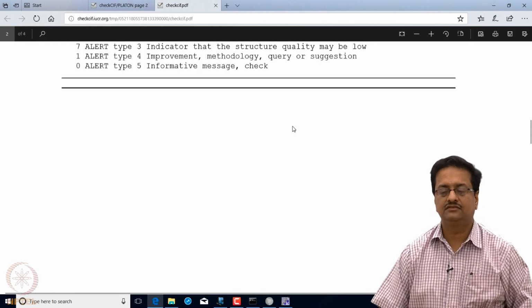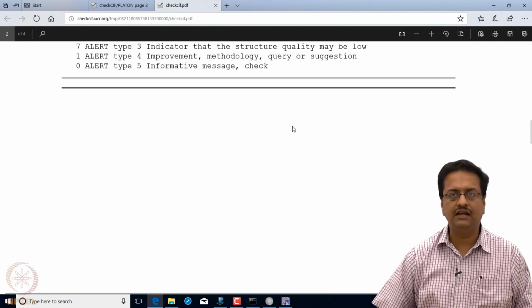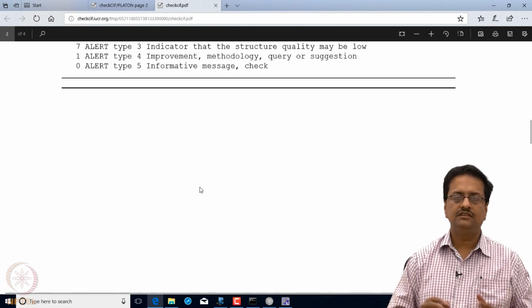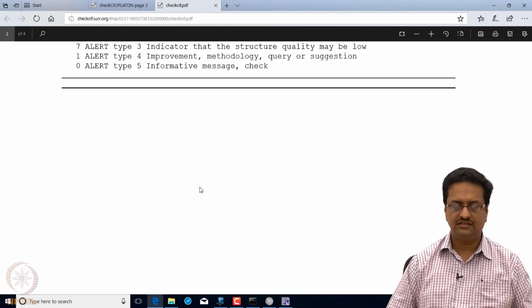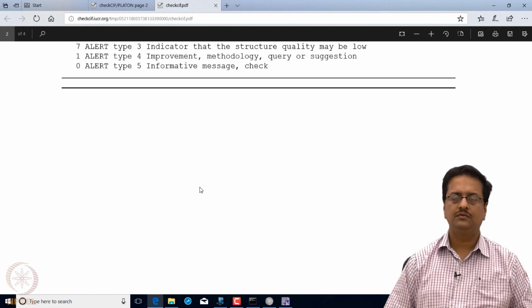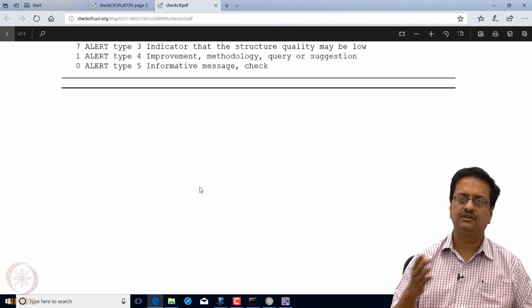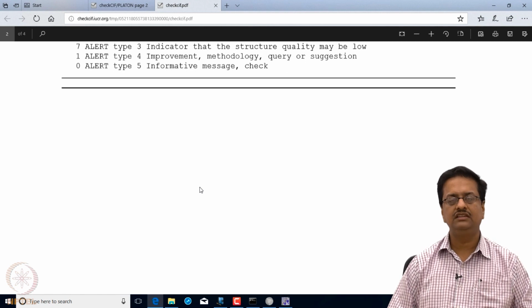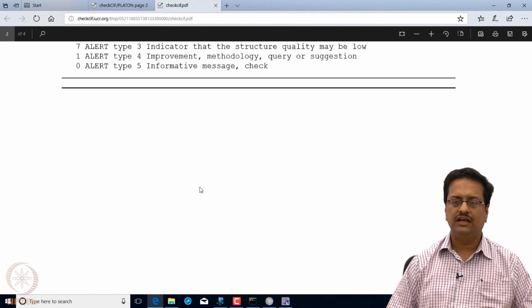So this is how one can solve a structure, refine and then do a validation of the structure using the IUCr website. So in this part of the lecture we have discussed the structure solution and refinement aspects, which is done through different packages. Here I have shown it using OLEX2 and ShelX. There are other platforms like WinGX which also uses ShelX for the structure solution and refinement, and I would like you to explore WinGX as well, because we do not have enough time to discuss all the available software, so one can explore them individually.